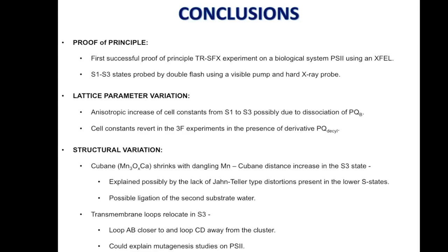And the second important thing is the structural variation of the oxygen evolving cluster. As mentioned here, the cubane shrinks when we go to the S3 state, and this is probably explained by prior theoretical and experimental studies of Jahn-Teller type distortions. And what is interesting is that it is also possible to host, as a ligand, the second substrate water that is required to complete the reaction.